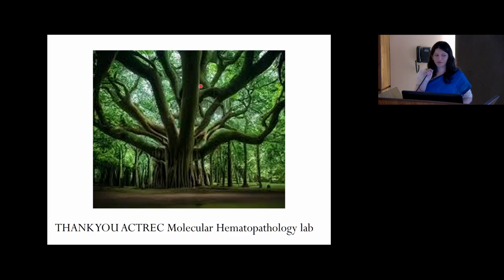Yeah, so I would prefer to be neutral, because every platform has its own advantages and disadvantages. And coming to library preparation steps, I think it's more or less a similar amount of effort that goes in. The number of steps would be lower in an amplicon based library preparation. Coming to data analysis, of course it's more user friendly, so everything is automated, so we don't have to put in those manual efforts.